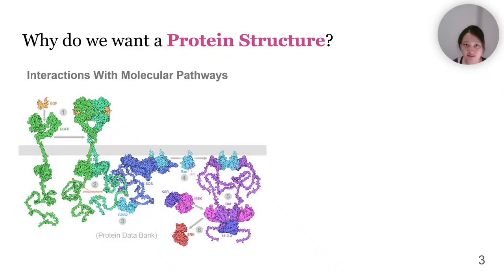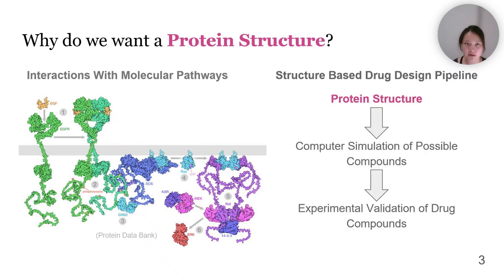Such information is of clinical significance, as it, 1. Gives insight into how the protein interacts in key molecular pathways, and 2. Allows us to design therapeutic drugs in a process called structure-based drug design.